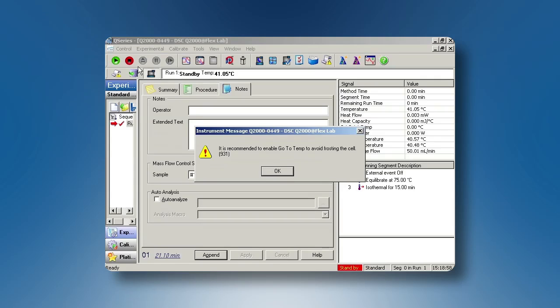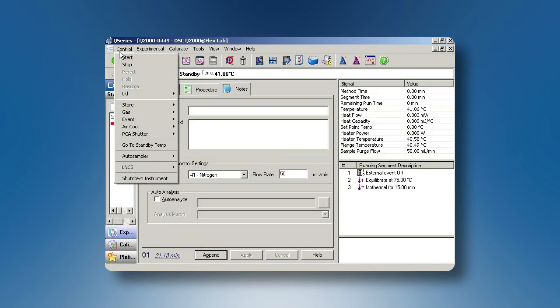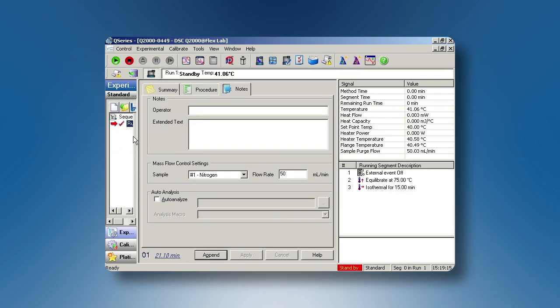You will hear the compressor on the RCS begin. There is a message to enable go to standby temperature to avoid frosting of the cell. To do this, select OK, then control, then go to standby temperature. Once the RCS temperature or flange temperature is subambient, you are ready to begin your experiments.